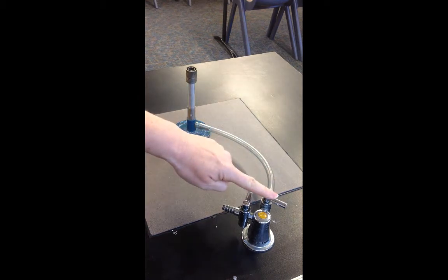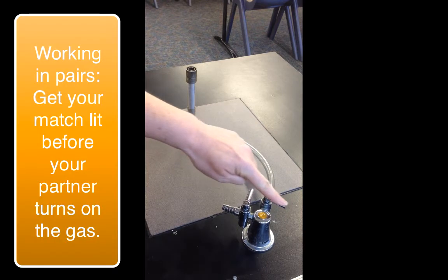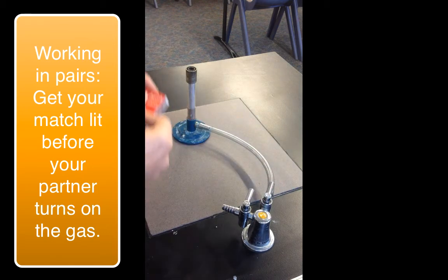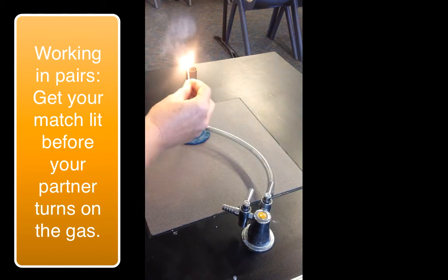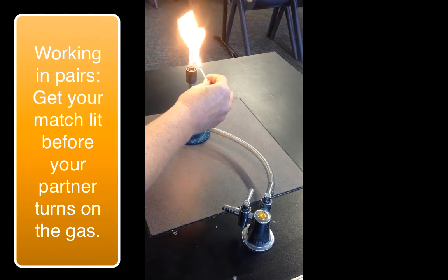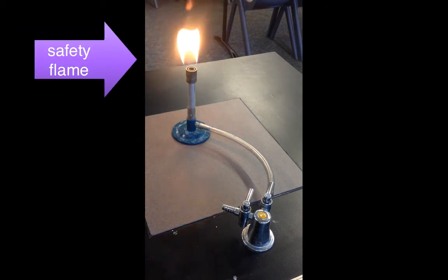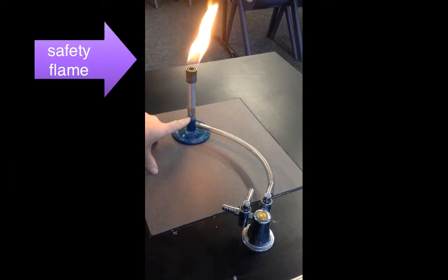You get a friend to turn on the gas so that the handle points in line with the gas tube. When the Bunsen lights, it will light with a yellow safety flame if the holes are closed.